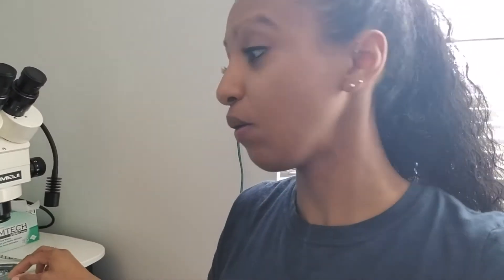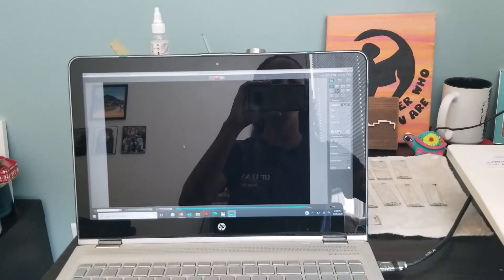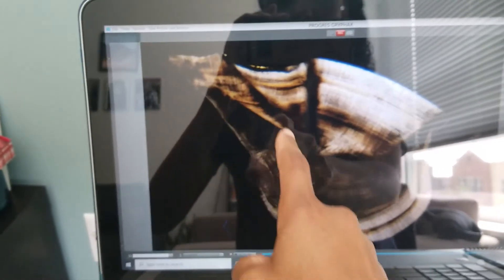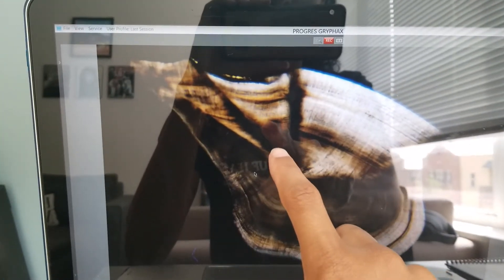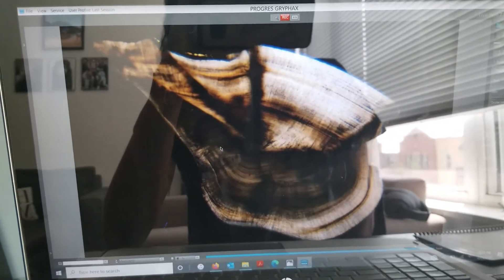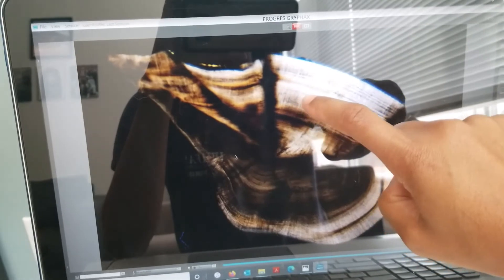Our finished sections look like this on the microscope slide — we have three of them. We can put them under the microscope to see how old they are. When you see this V shape right here, it means we have a good strong core, which is the best place on an otolith to read the annuli. We're looking for those dark opaque rings laid down in wintertime. This dark line right here is its first ring, and here is the second dark ring, so this fish would have been two years old at the time it was captured. The clear area between the dark lines represents summer growth, when the fish is eating a lot and conditions are favorable.